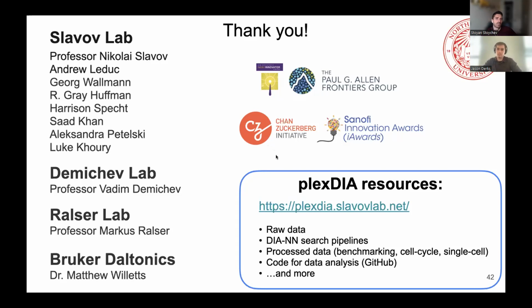Okay, awesome. I don't see any more questions. Here we go. There's one more coming. Given Jurkat and U937 are different cell lines, I would not expect there to be 97% of the same peptides. How did you validate the plexDIA data completeness is not due to spurious matches and false positives?